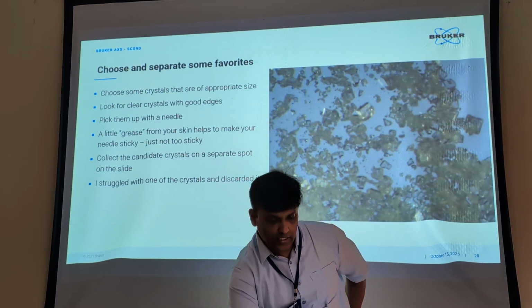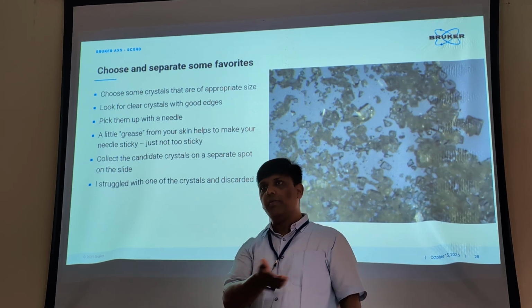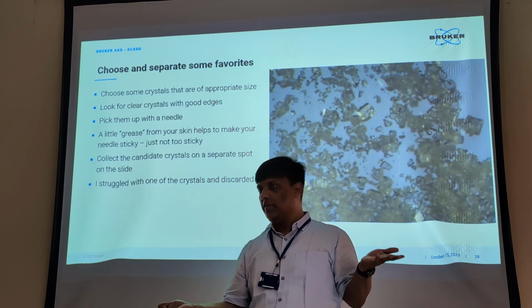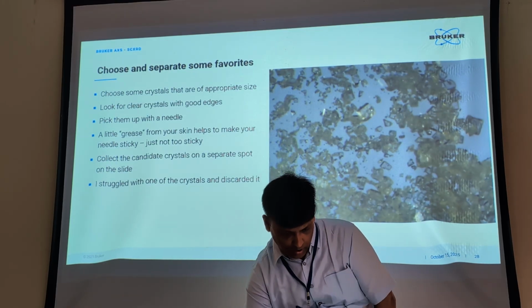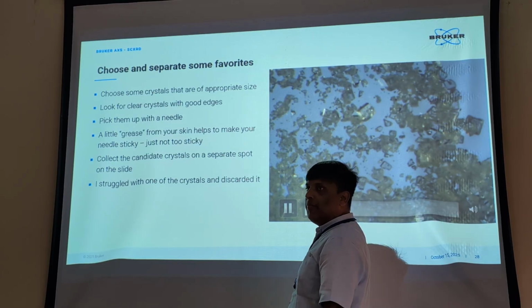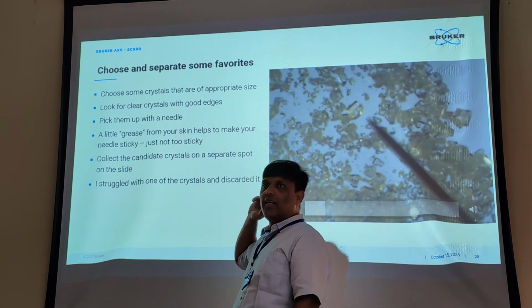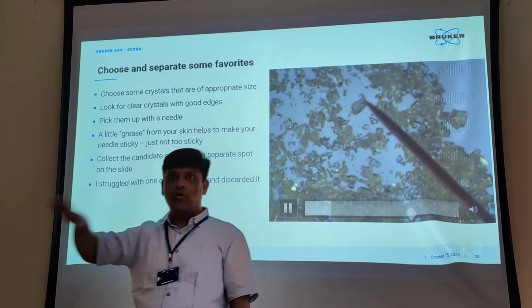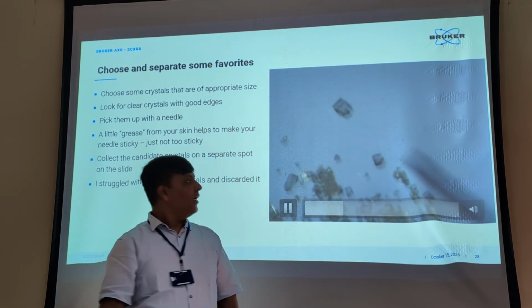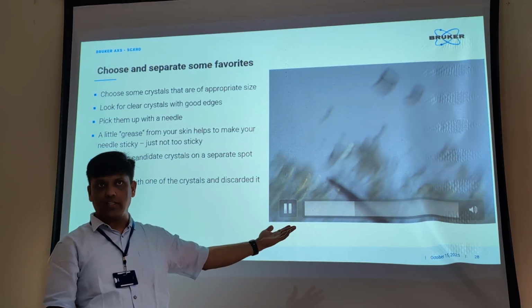Okay, so if one or two of you come in the next two days, we will be doing this, and you can have a look, but you can also watch the video. So this is under the microscope what we are seeing here. Here my colleague is really lucky, he has plenty of crystals, but generally you don't. You have already seen, you will get only a few crystals, and out of these you would like to select some candidates for the diffraction experiment.